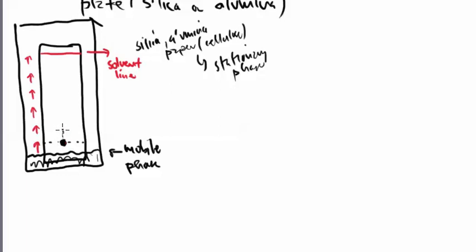So what begins to happen is that we begin to see some separation that happens on the plate itself. And let's say that there's 4 amino acids that are in that sample that I spotted in the very beginning. What we would hope to see are maybe 4 different dots, one representing each amino acid that is there. So again, you got to kind of know something about your sample, what's the idea of how many amino acids that I should be looking for.